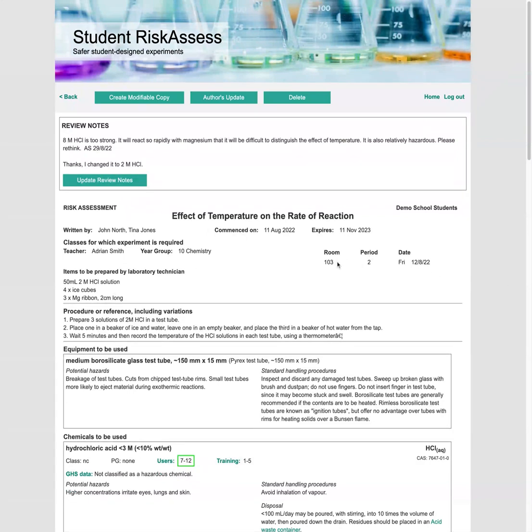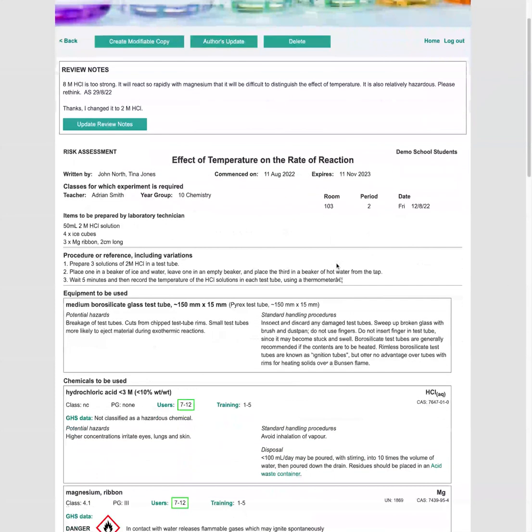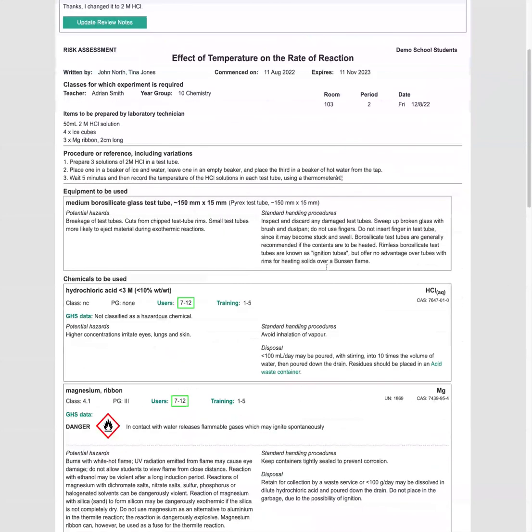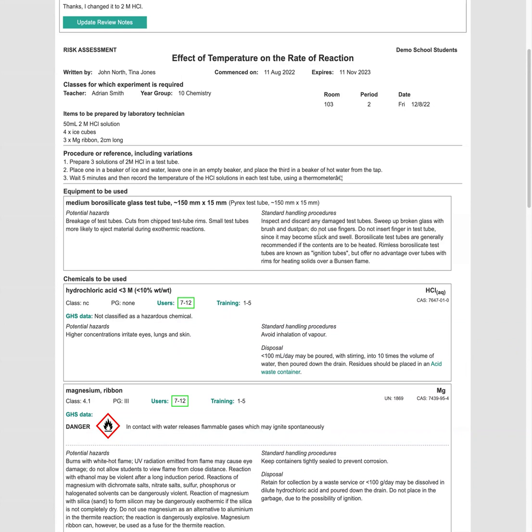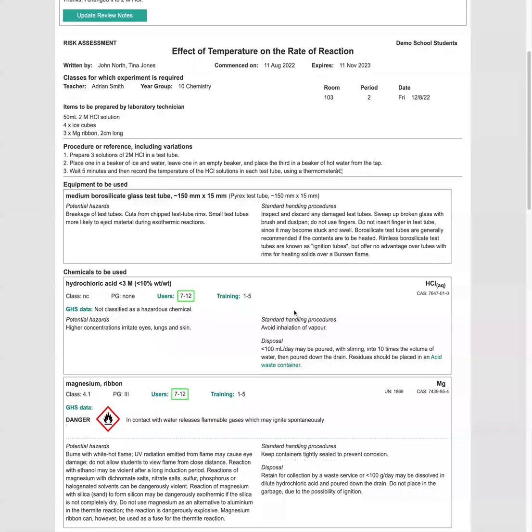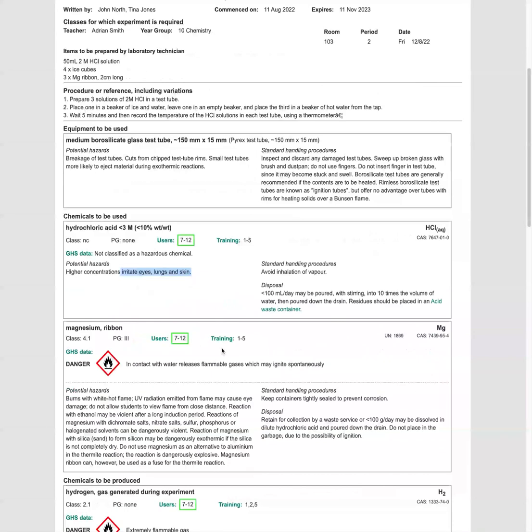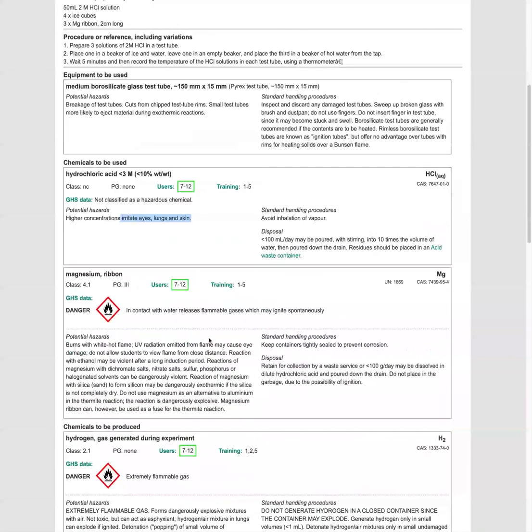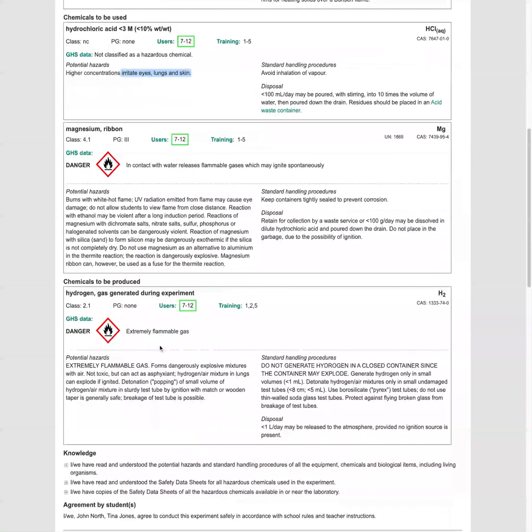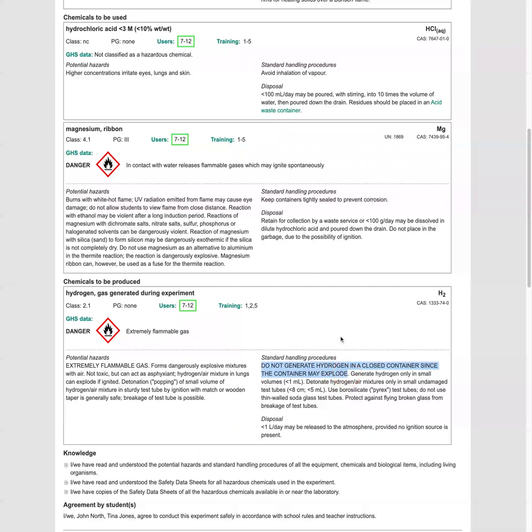Now let's have a look at the background safety information that's been provided from the risk assess databases. So on the test tubes, yes, keep an eye out for any damaged test tubes. We need to have a look at the hydrochloric acid. It irritates the eyes, the lungs and skin. Magnesium ribbon, flammable and hydrogen gas generated during experiment. We've got a warning not to generate in a closed container because many injuries have resulted from explosions here.